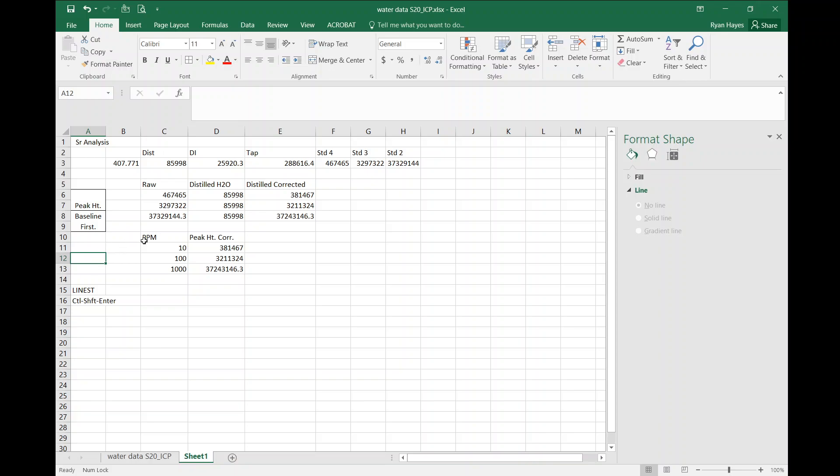All right, this video is going to show you how to set your trendline through zero. I've taken some ICP atomic analysis data and I have subtracted out the distilled water signal.